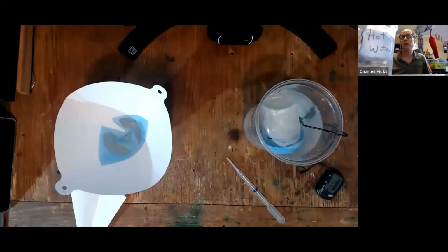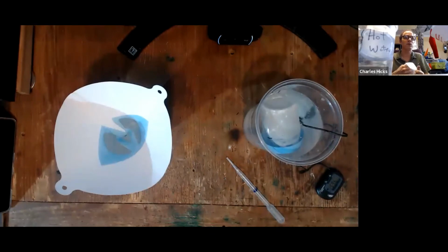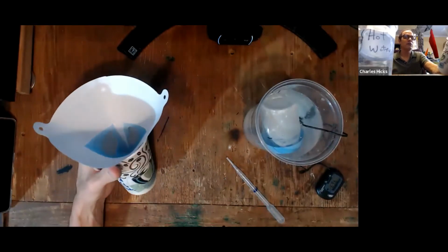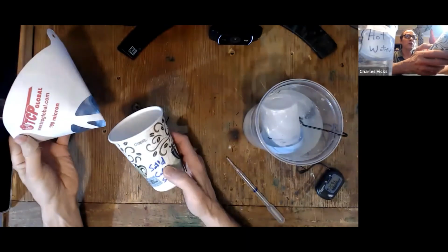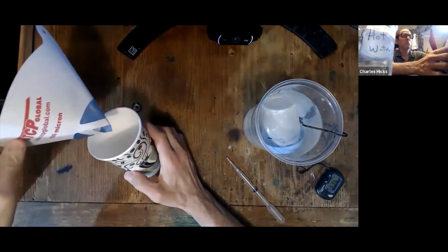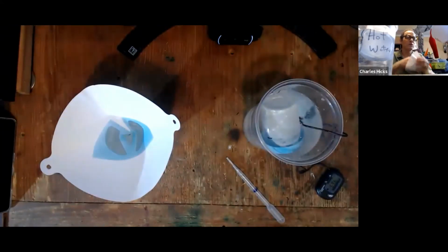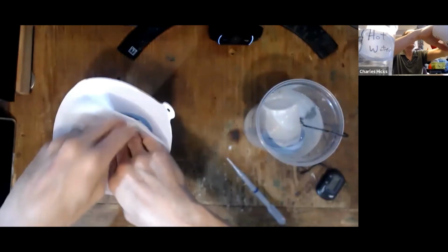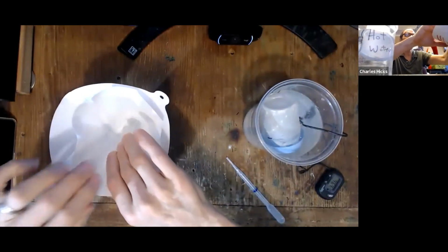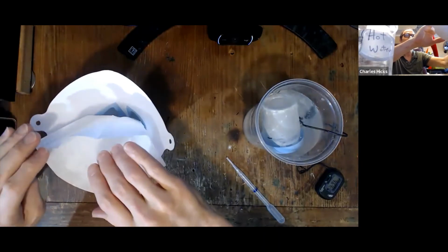Okay. So while that 2 minutes is passing, you want to set up a filtration apparatus using that pre-weighed filter. Filtration apparatus in this course is always that we use a coffee cup to collect solution if we're interested in that. And we put these disposable funnels on top of the cup and use a coffee filter. And this is the pre-weighed coffee filter that I have for the hot trial.